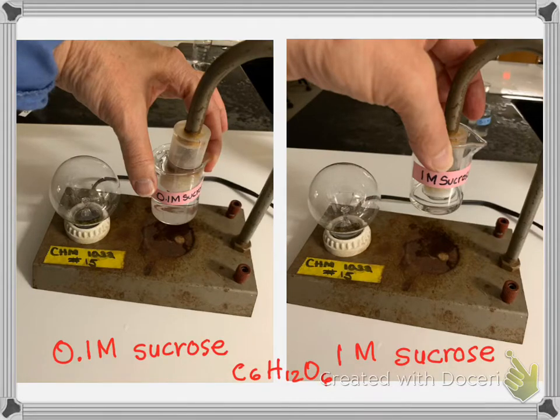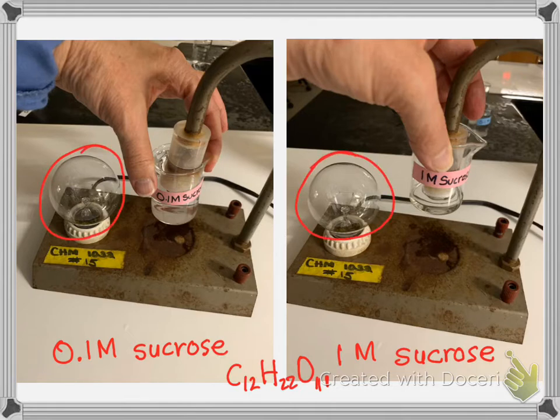Let me correct myself, that's glucose. C12H22O11 is sucrose. Both sucrose and glucose would do the same thing. They're carbons, hydrogens, and oxygens. There are no ions. How can I tell there are no ions? There is no light. The wire's not even lighting up. No ions, so this is a non-electrolyte.